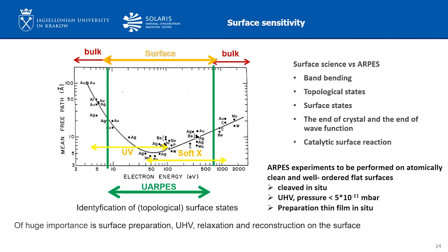The surface sensitivity is an advantage when the aim is to record surface states, such as in topological insulators and Weyl semimetals, but it requires the ARPES experiment to be performed on atomically clean and well-ordered flat surfaces. Of course, it's very important.